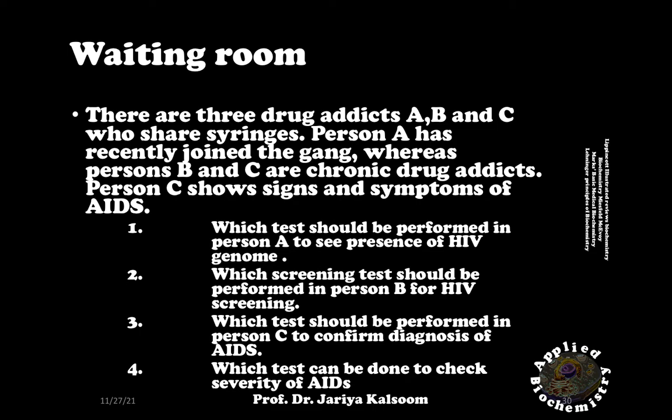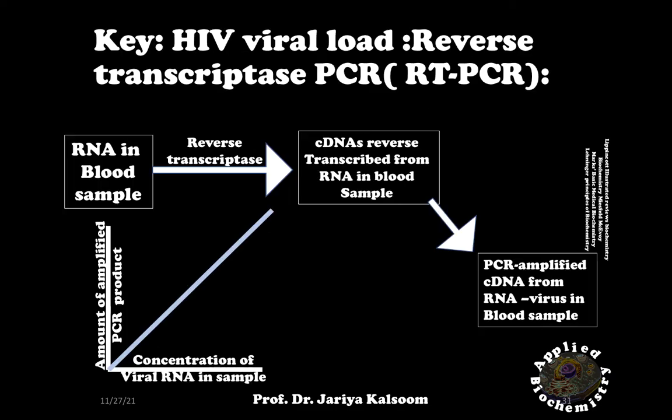If the person is not infected, there will be no PCR product detected. It has two advantages. It is much earlier after infection and does not rely on an antibody response by the individual. Reverse transcriptase PCR, or RT-PCR, detects and quantifies specific RNA.